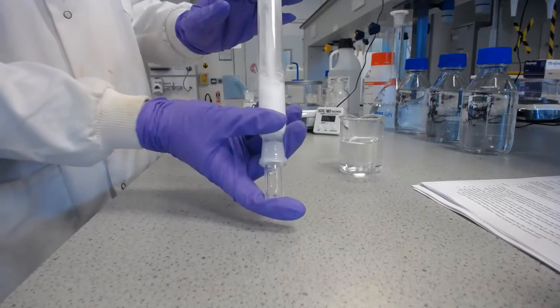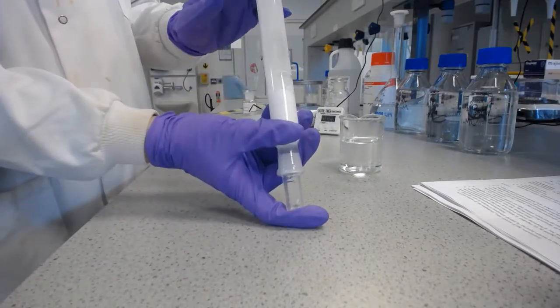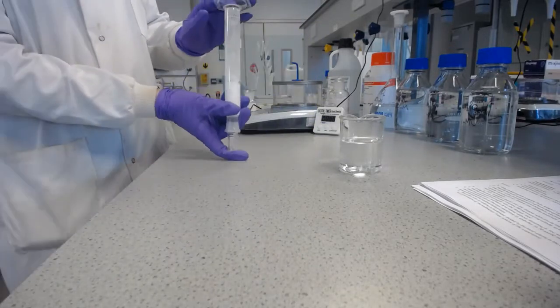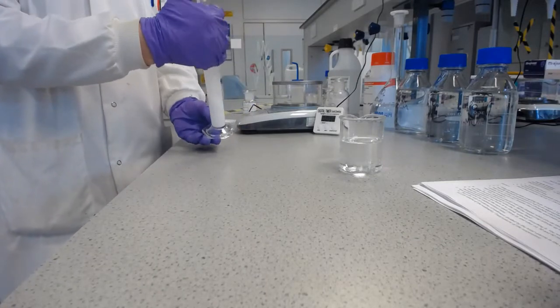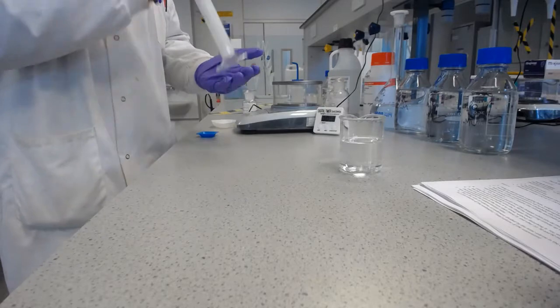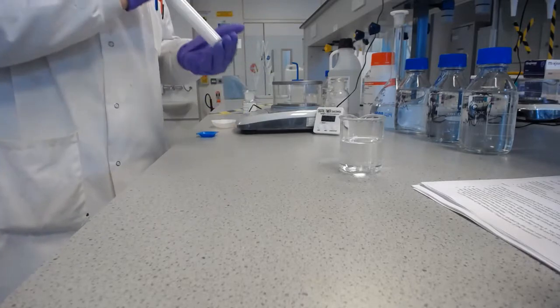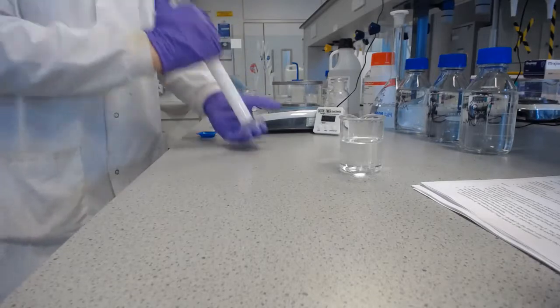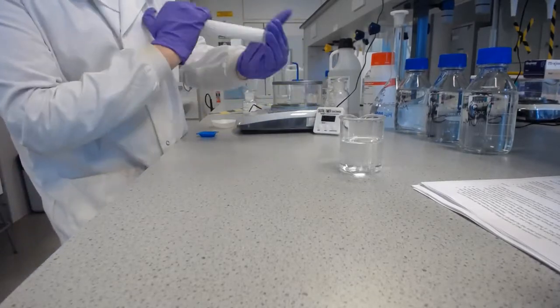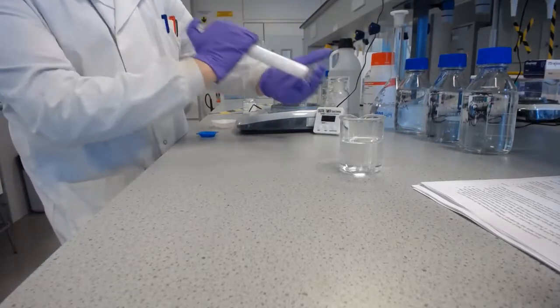And when you invert with the stopper in, we always keep a finger or a thumb over the stopper because you can't really trust them to stay in place. Okay, I'm going to give that quite a shake, making sure the stopper's still fixed. You can see the best cocktail impression.